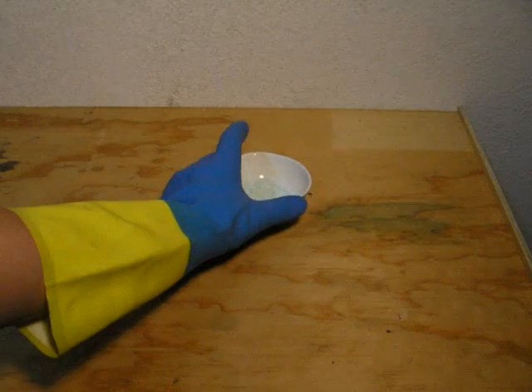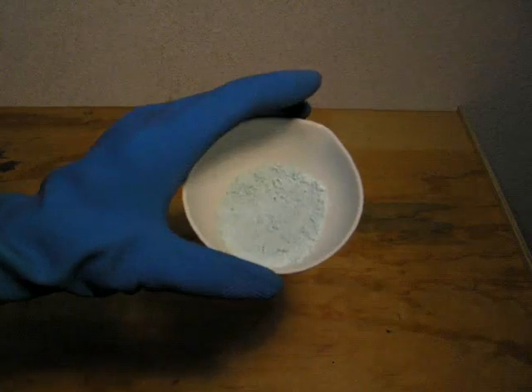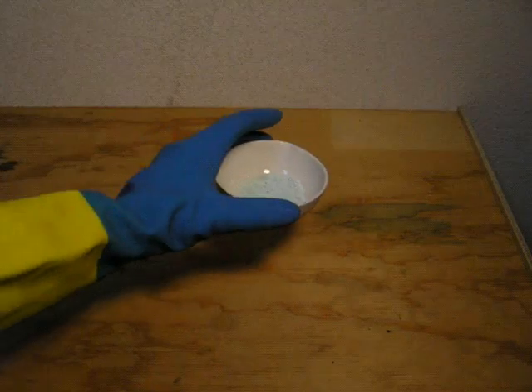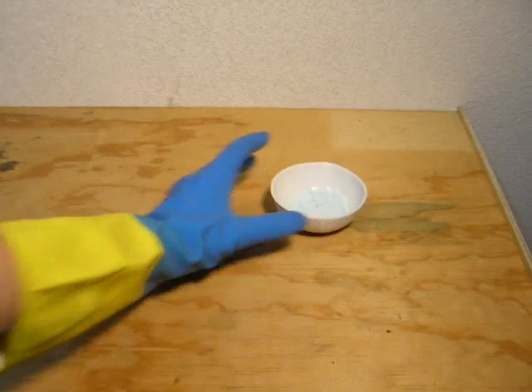This copper sulfate is now suitable for use as a desiccant. For example, it can be used to dry solvents. So here it is: 10.46 grams of anhydrous copper sulfate.